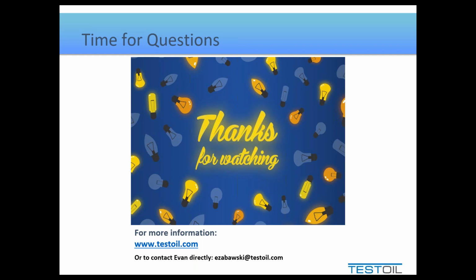And when we do patches, we can go to EDXRF, and again, that can help identify the elements that are found on the patch that have separated out. So I don't know if that fully answers your question, but my short answer would be I almost don't know if I'd worry about that because I would expect the organic iron particles to be larger, and I would not expect to find them under ICP analysis. I'd probably expect to find them under some other test. But that's about all I can conjecture at this point. Mm-hmm. I would agree with that.